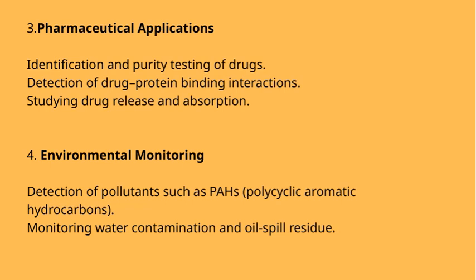Now, let's explore some key pharmaceutical applications of our techniques. First, they play a crucial role in the identification and purity testing of drugs, ensuring that what reaches patients is safe and effective. This is vital for quality control in the pharmaceutical industry. Next, these methods help detect drug-protein binding interactions, which are fundamental in understanding how drugs work in the body and can influence drug design.